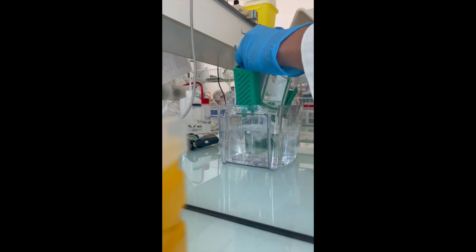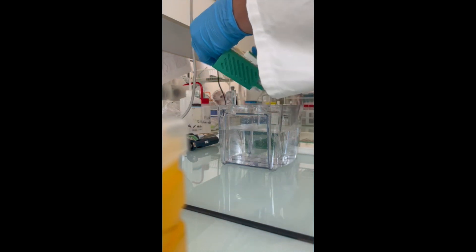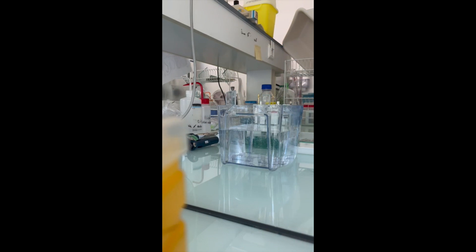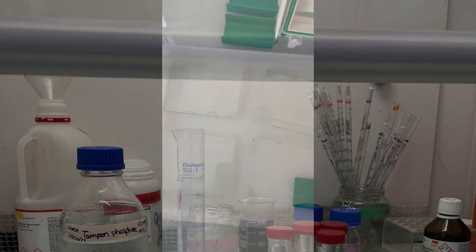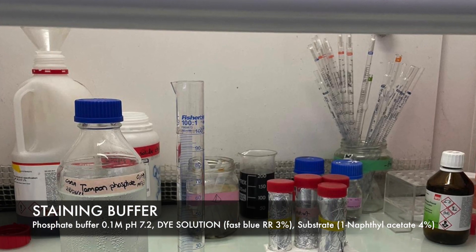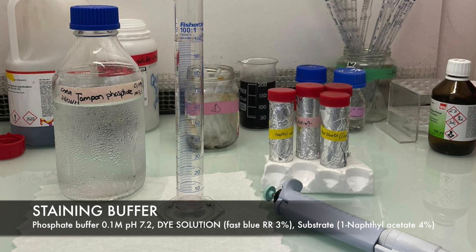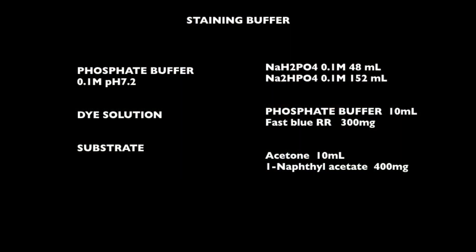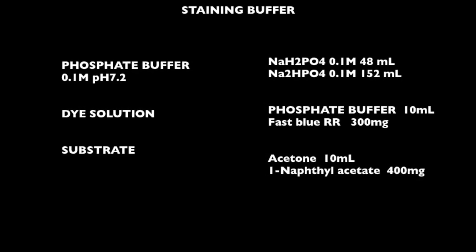You can use the two sides of the tank. Prepare the staining buffer. It consists of 0.1 molar phosphate buffer pH 7.2, the dye Fastblue RR 3%, and the substrate naphtylacetate 4%.